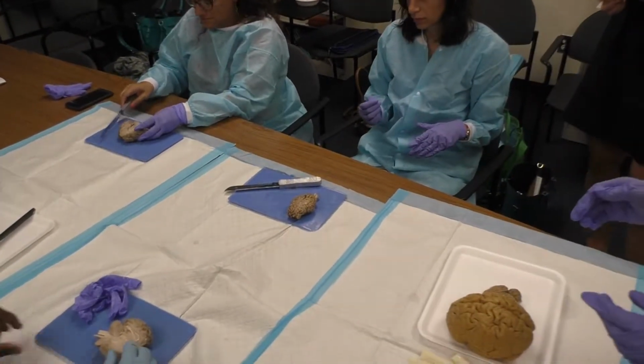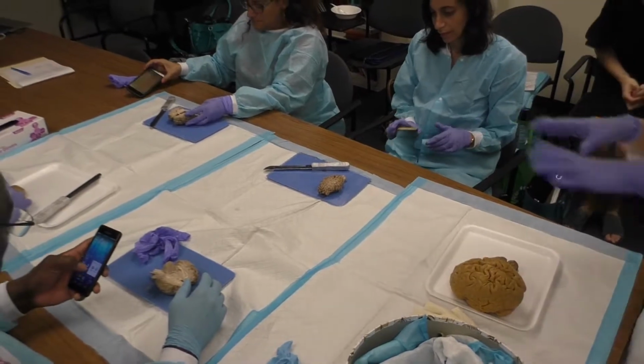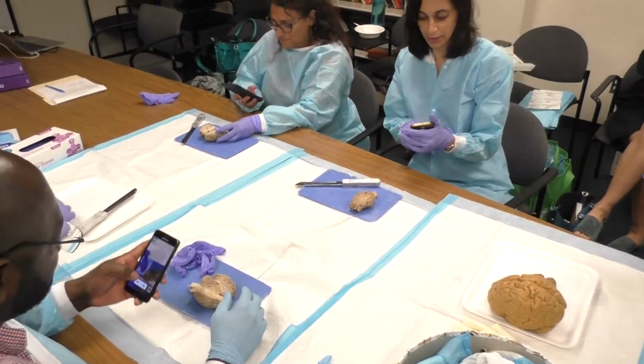Okay, so why don't you guys do that. If you want me to hold something so you can take the picture, let me know. I'll take you up on your offer.